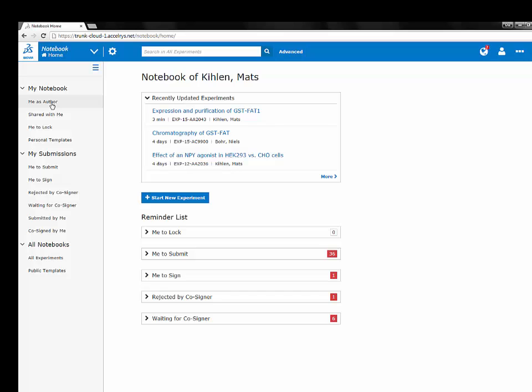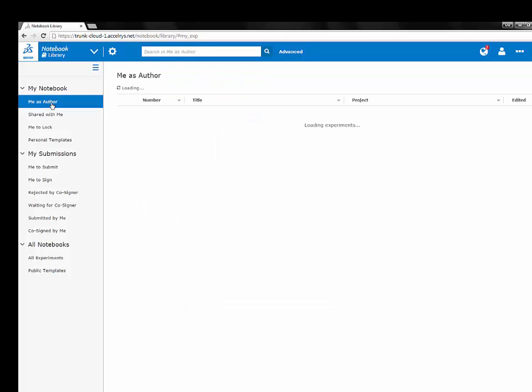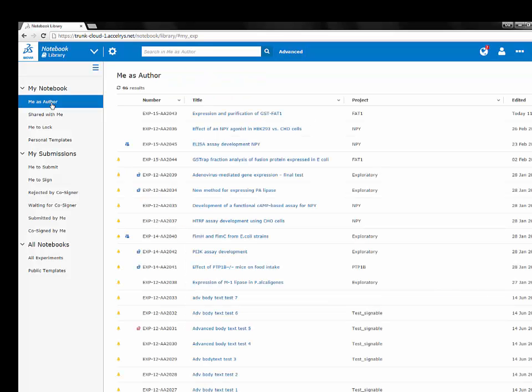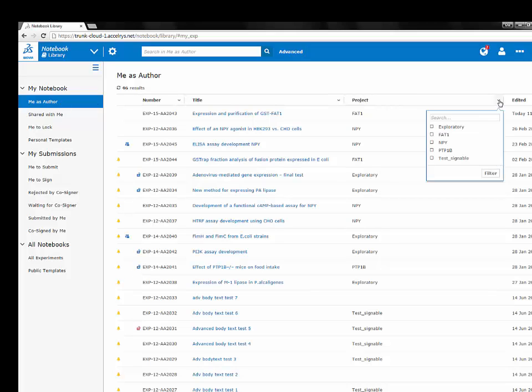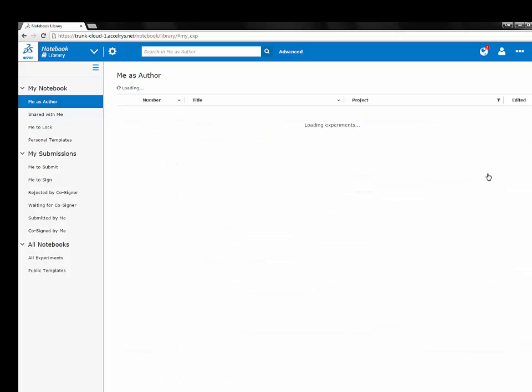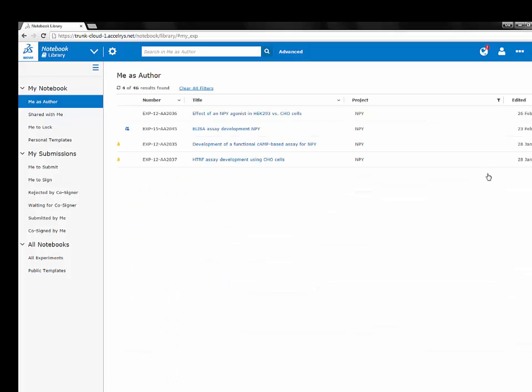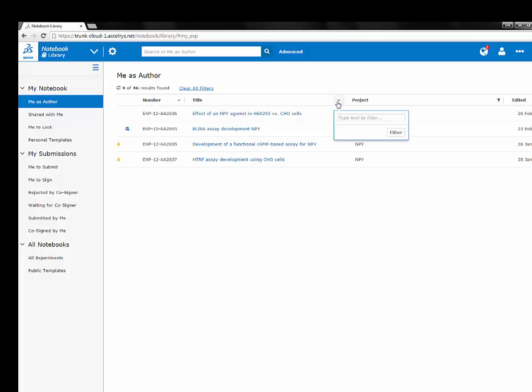Notice that the top navigation tool changes from home to library. When you view a list of experiments you always have the ability to filter or search for experiments by clicking on the symbol on the right hand side of a column. Here you can select a value or search by text. Filtering replaces the folder structure previously used to handle groups of experiments.